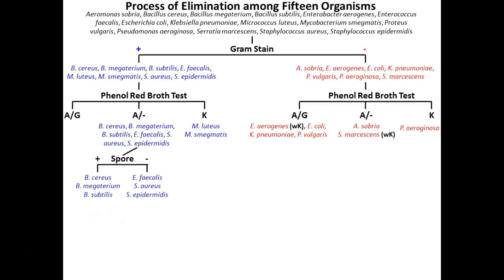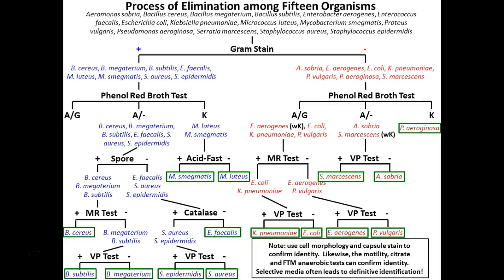So we already just talked about this in the beginning, right? How you can narrow down your possibilities. So definitely there's some problems with MR or VP testing. I would go by all your other tests first, and don't base your results on MR, VP.